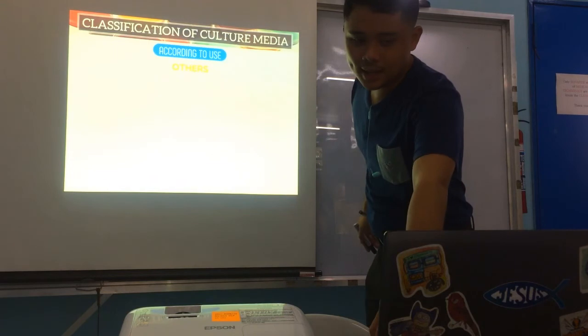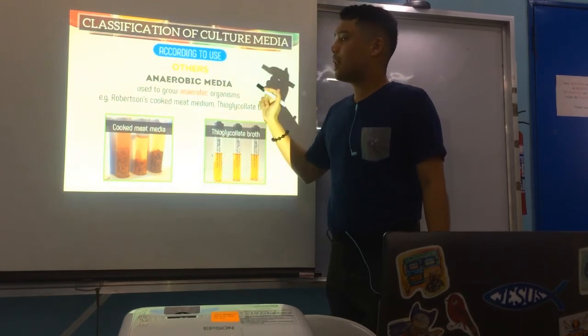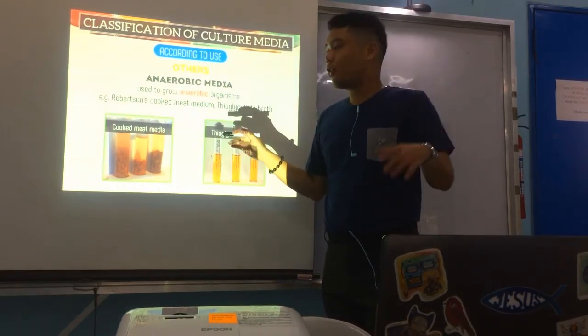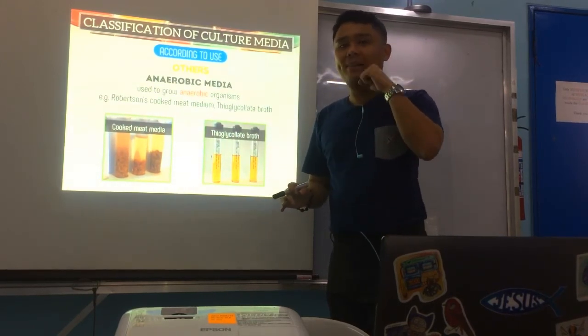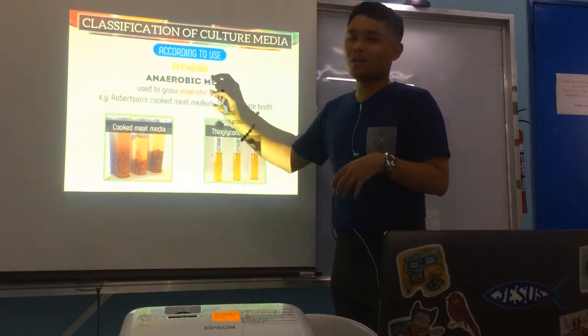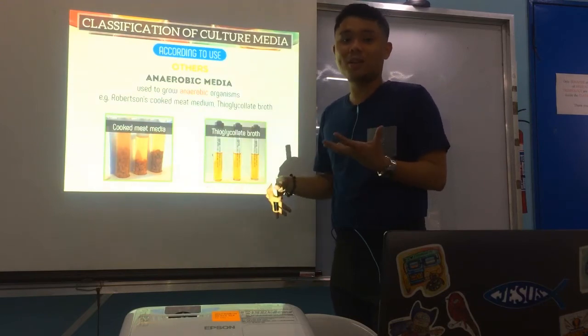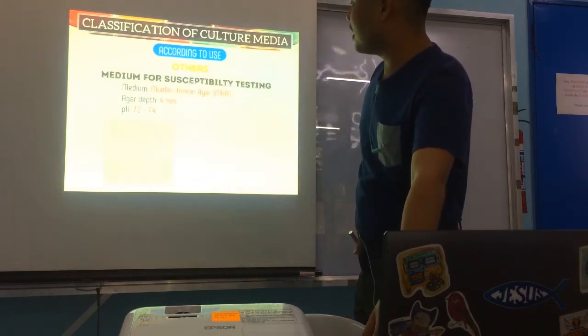Alright. Next is anaerobic media, guys. Maybe we'll have a discussion on anaerobic culture, but in terms of media, I will discuss it in lecture. It has a different kind of list of media not used in routine bacteriology, because these bacteria have many requirements. They are very special. They don't need oxygen or they don't want oxygen.